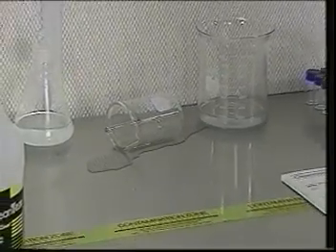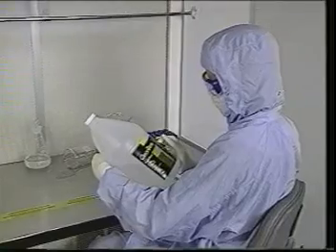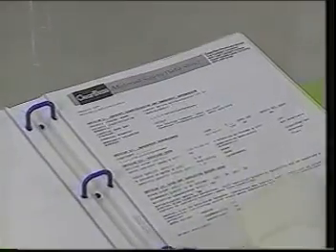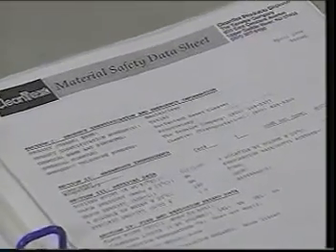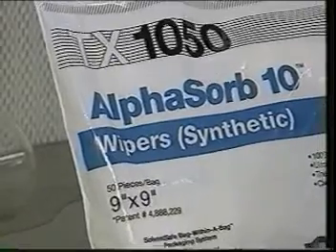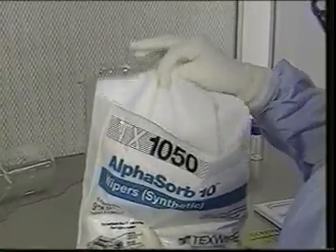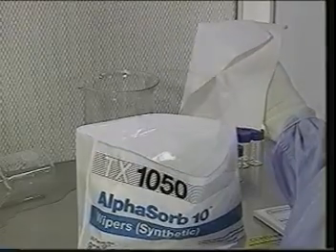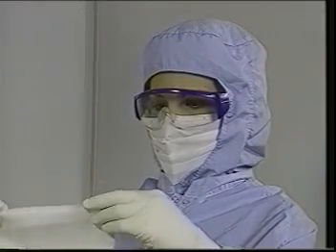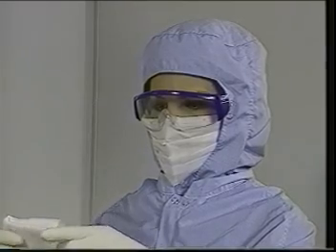If you're wiping up a spill, your first priority should be to know what you're dealing with. Once you've identified the liquid, check its corresponding material safety data sheet for precautionary information. Hazardous spills should always be dealt with using gloves and wipers that won't degrade when they come in contact with the particular chemistry of the spill. Be sure to wear any other protective gear that is necessary for safe removal of the spill.